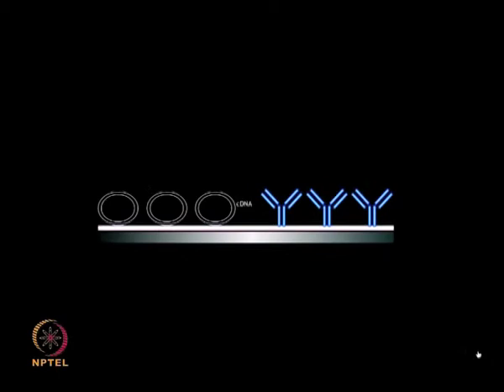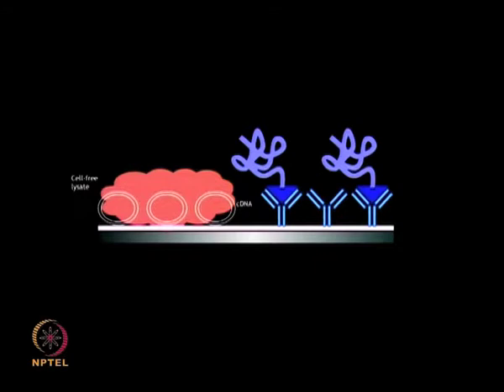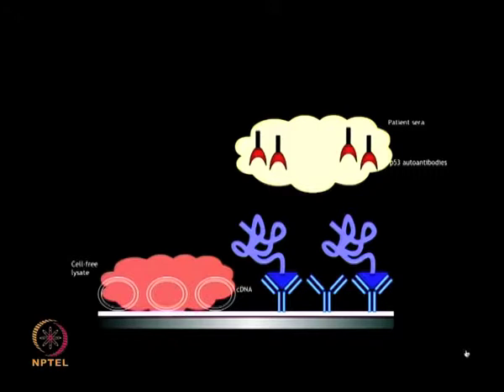In this study, the authors generated protein microarrays based on NAPA expression. As you can see, in the NAPA chemistry, cDNA, BS3, BSA and capture antibody, these four features are printed on the chip surface as a master mix. After addition of the cell-free lysate, proteins are expressed, which can then be further probed with the diluted sera of breast cancer patients, which contain P53 autoantibodies.